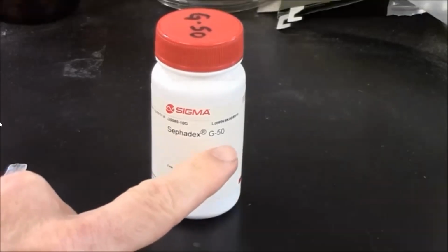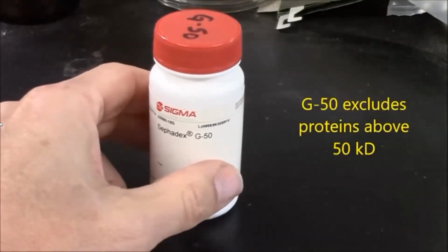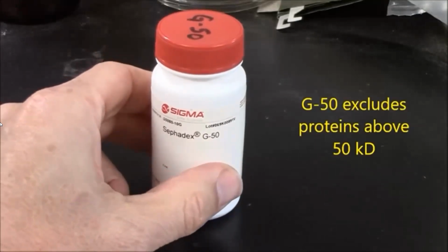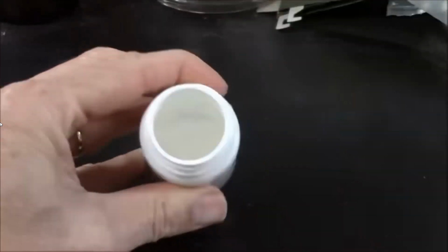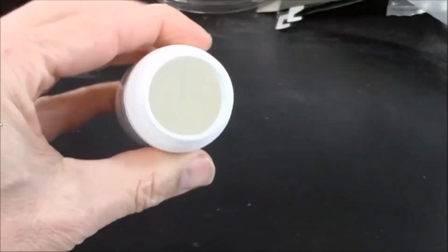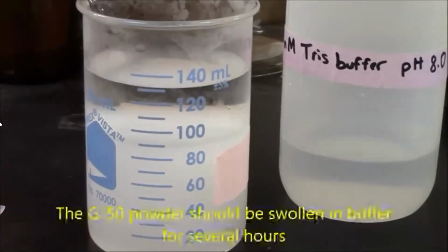G50, the number here gives you an approximation of the size exclusion. So this will exclude proteins above 50 kilodaltons, 50,000 molecular weight. Inside is a white powder. In this beaker, I put 9 grams of the G50 powder, and I swelled it.